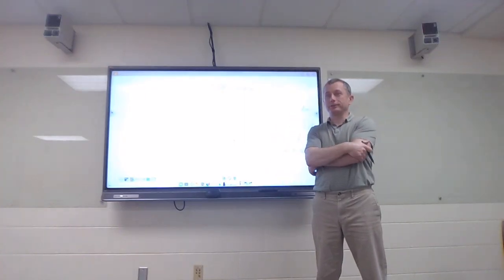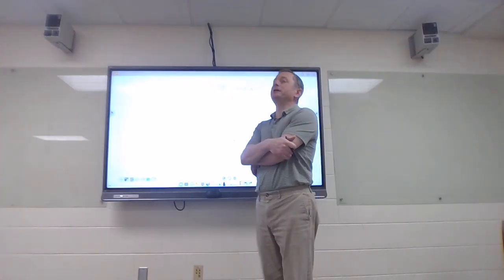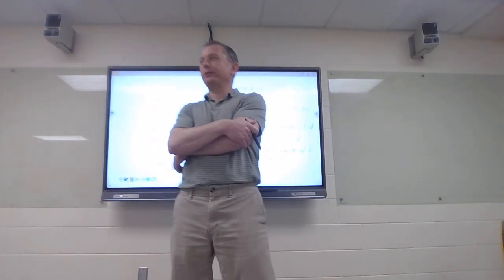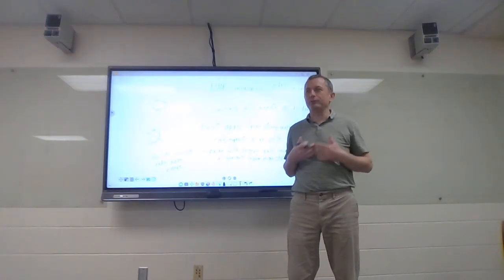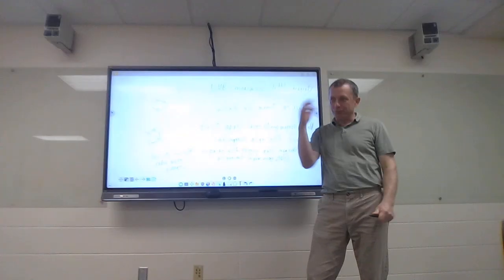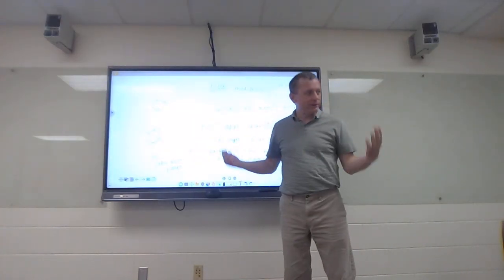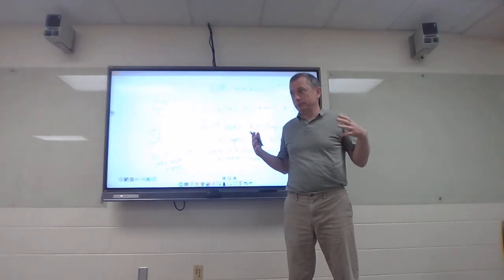They put you first in a big magnet, right? They've got to put you in a big magnet. So what you probably didn't realize and didn't necessarily sense in that process is that when they put you in that big magnet, all your nuclei inside of you were lighting up with that magnetic field, and then they're pulsing you with radio waves and waiting for those to relax back down. It gives off signals based on the environment it's in. Now, that's a lot of signal.